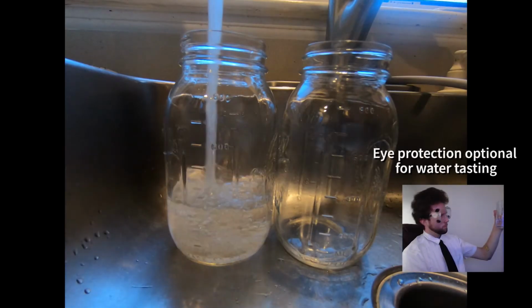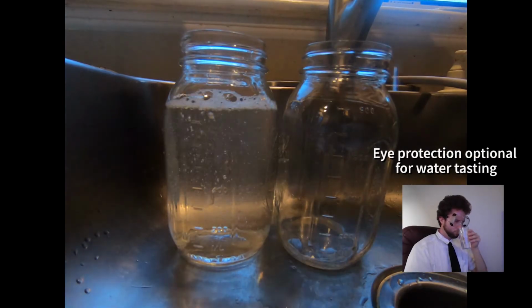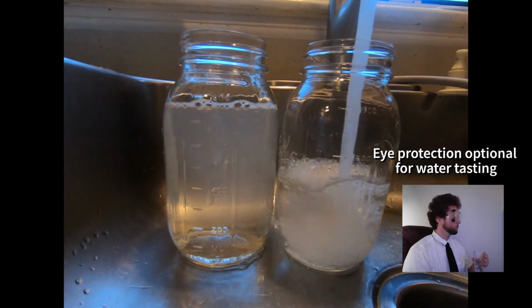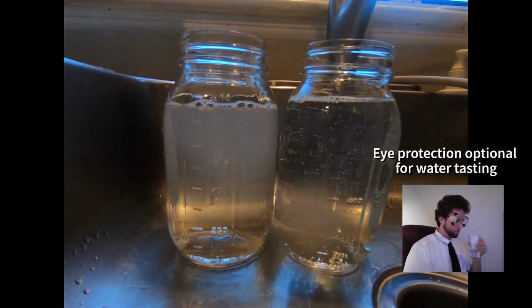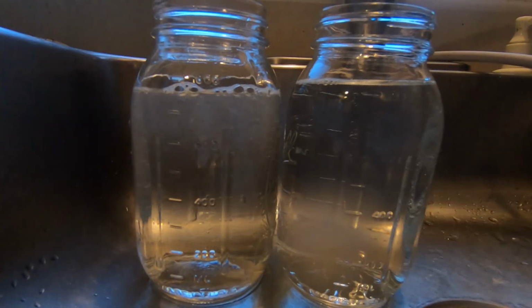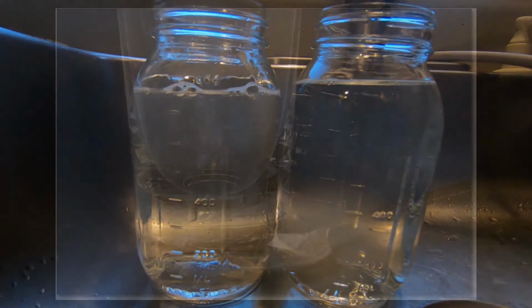Test your water samples. Make any visual observations, and then annotate them. Visually, my hot water on the left looks a little cloudy here. The cloudiness goes away, but a residue on dishes can indicate hard water.